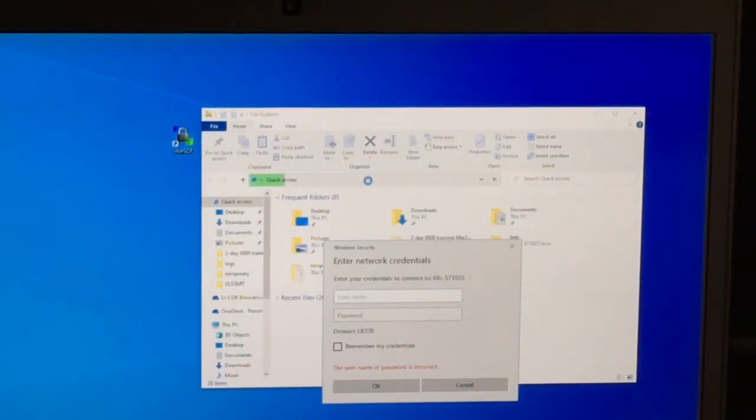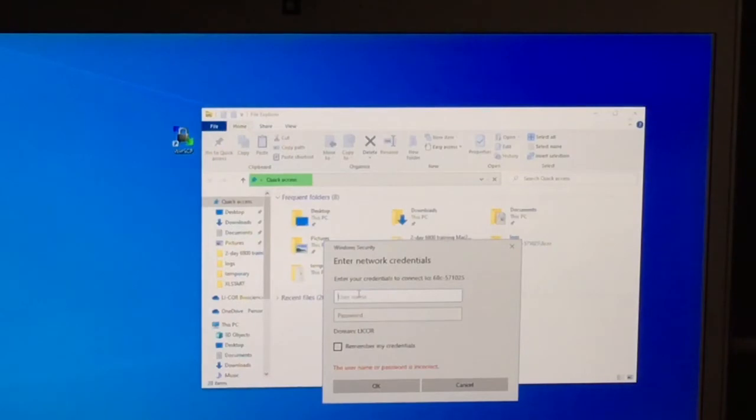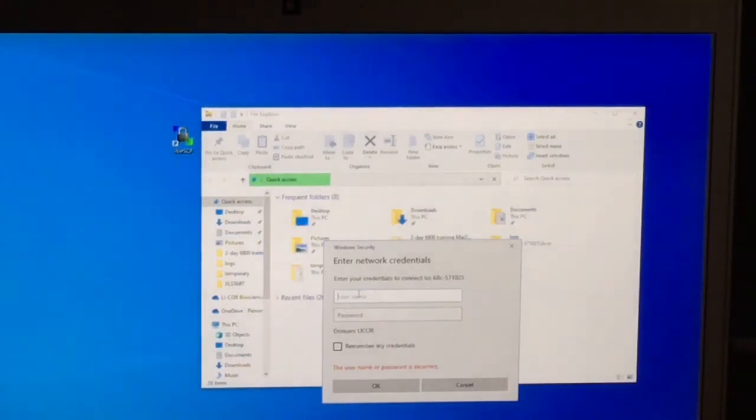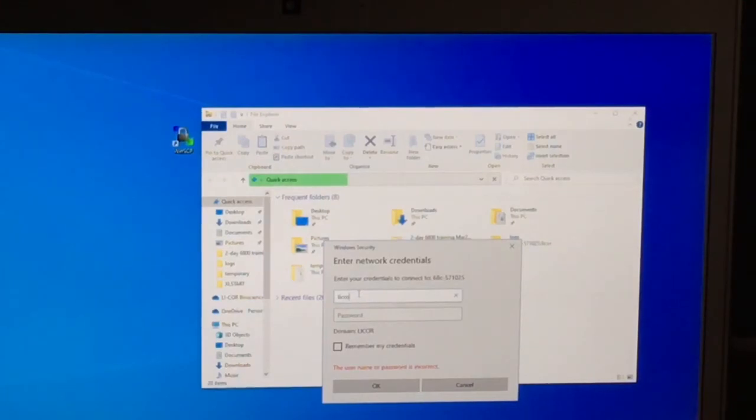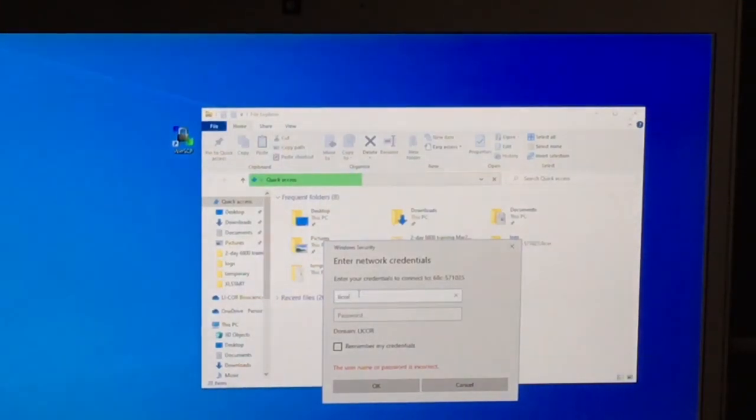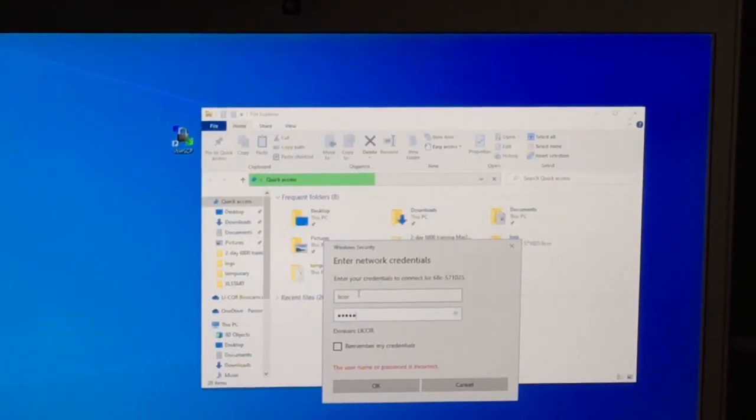When this window pops up, just enter LICOR for both the username and the password. LICOR L-I-C-O-R, lowercase, no space, no special symbols. Then, press OK.